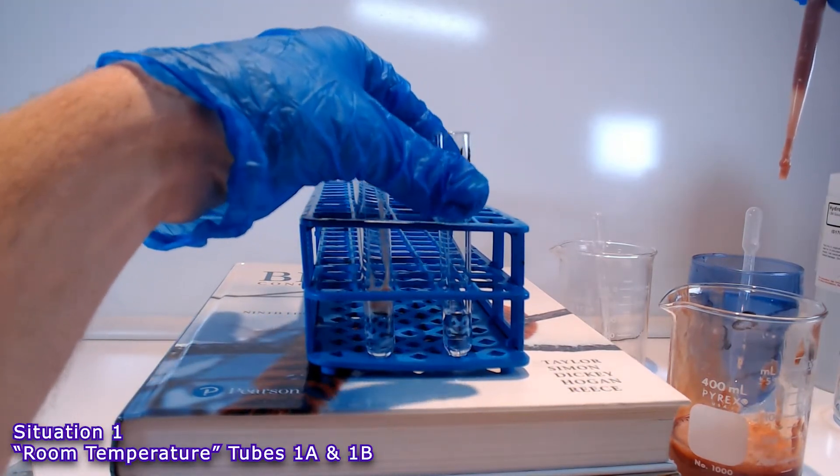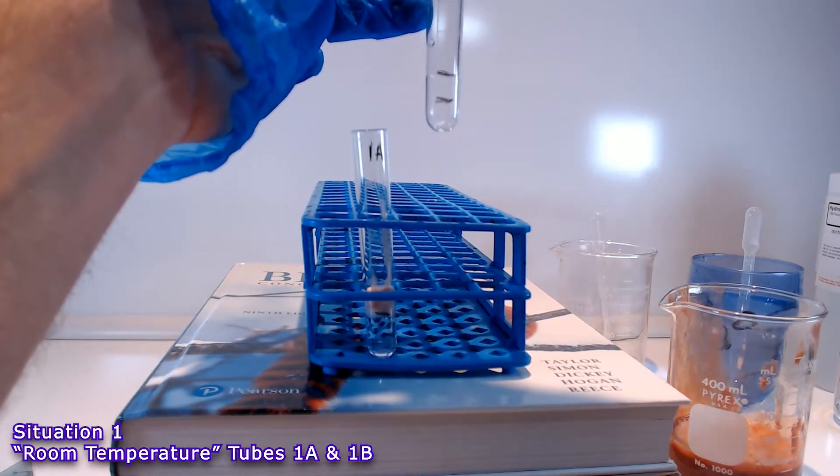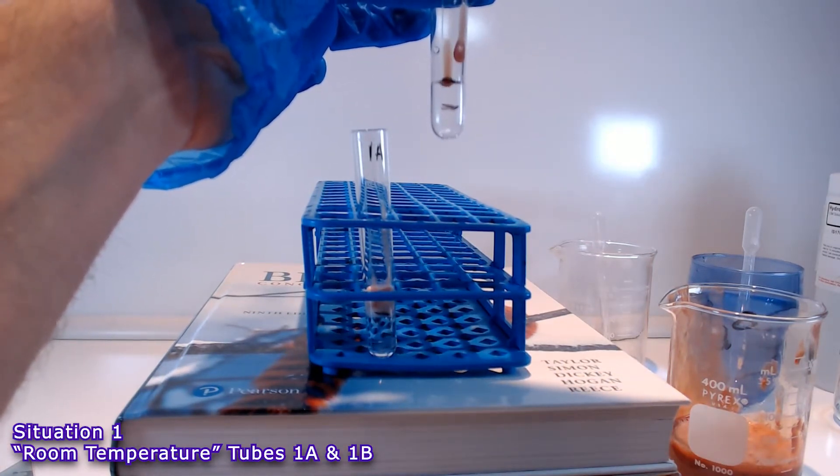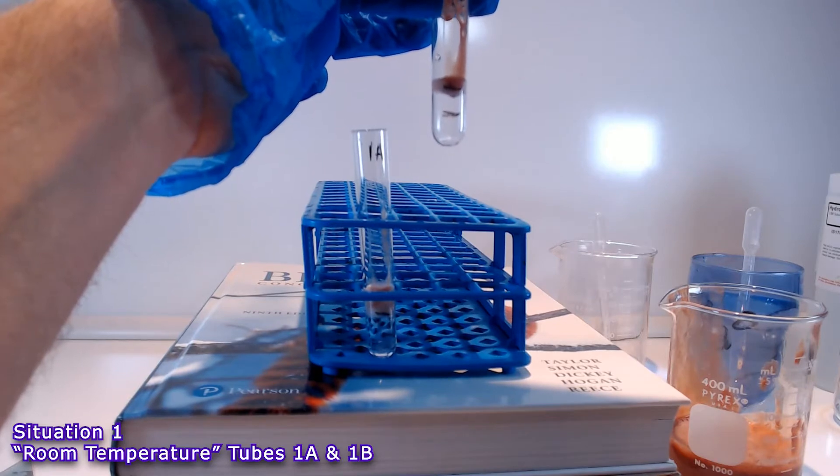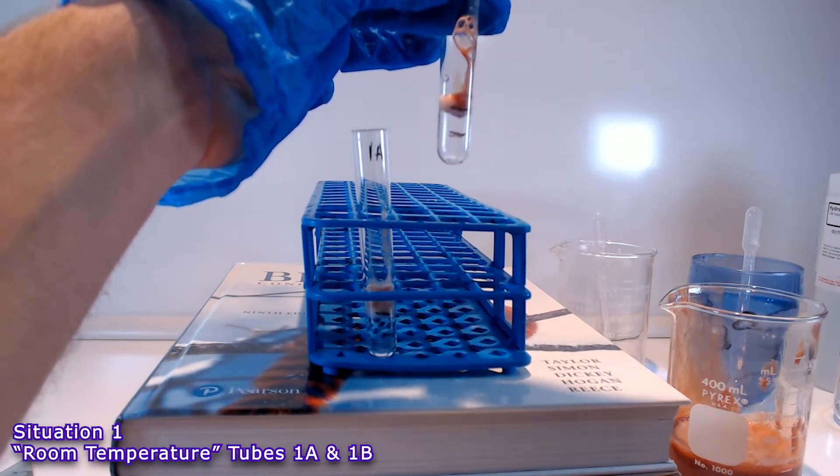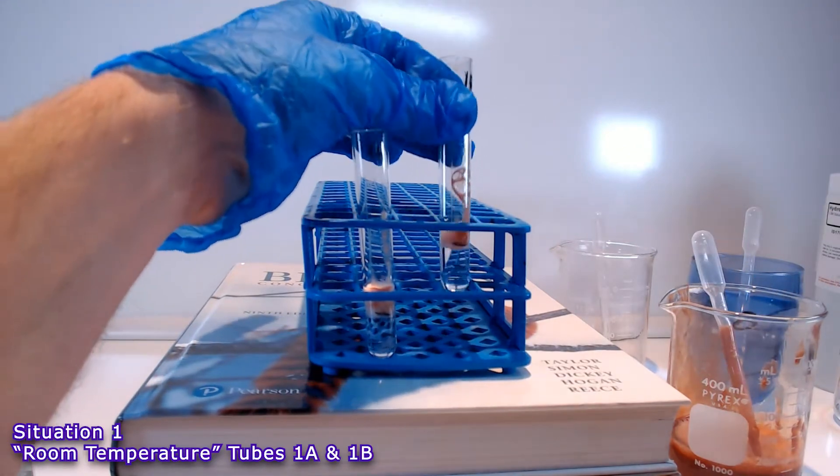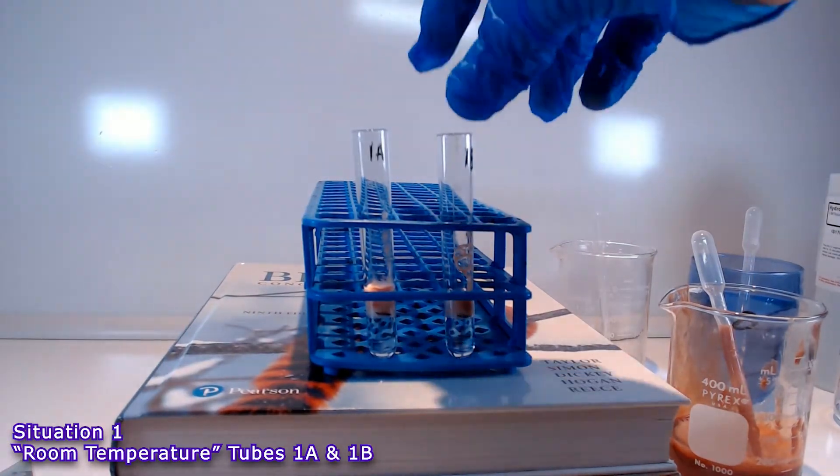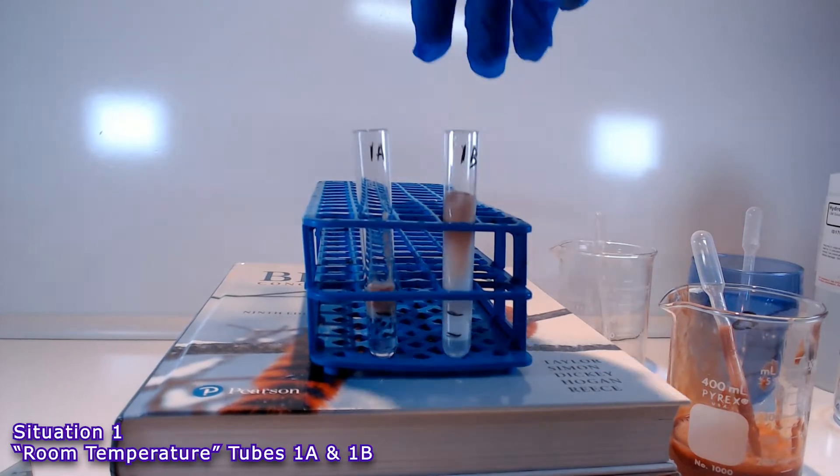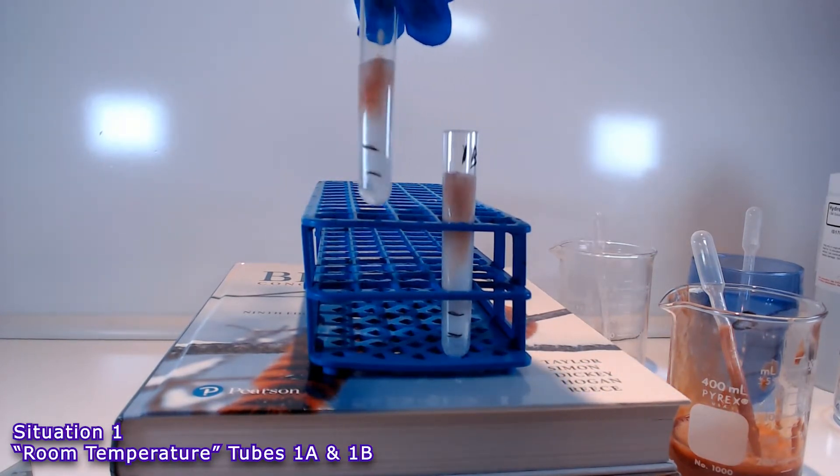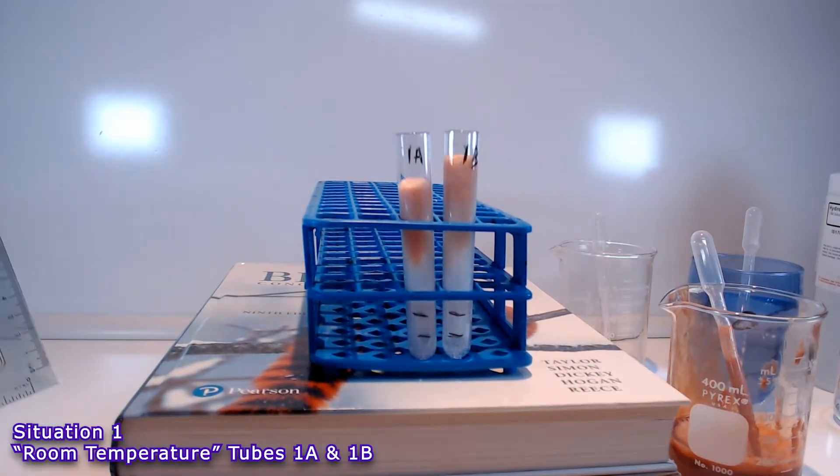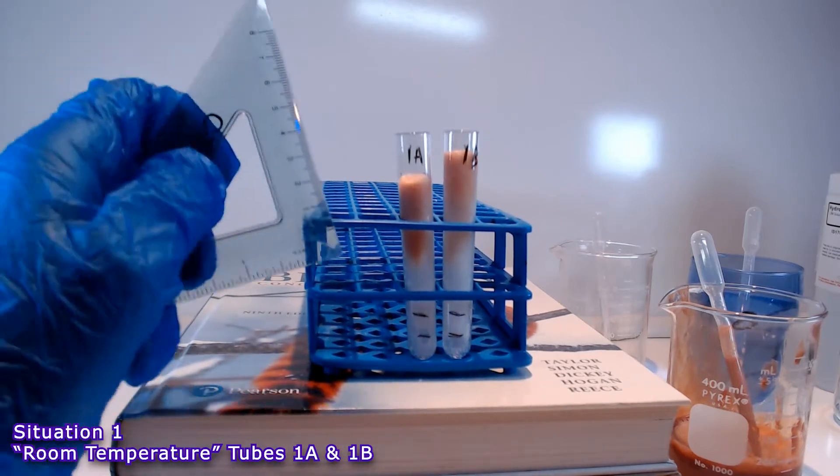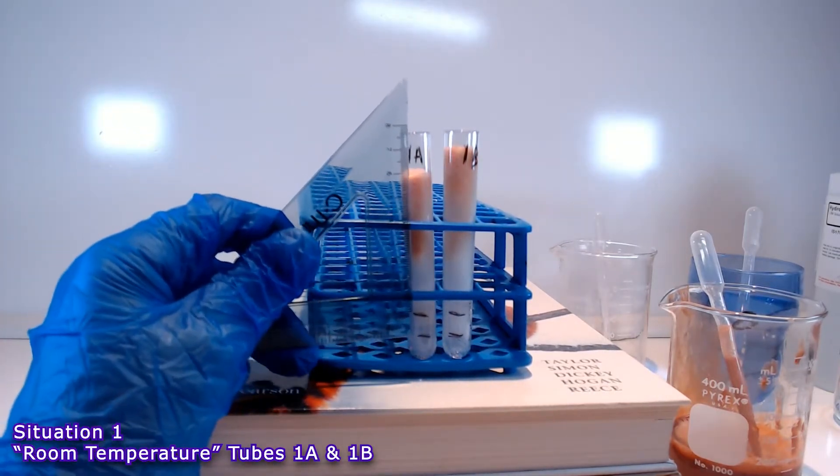You can already see some bubbles beginning to form. Refer back to the lab protocol to understand what those bubbles represent. Now in order to make sure that the substrate and enzyme are mixing, let's agitate the solution a little bit, and you can see that not only do we form a column of bubbles, but that the column forms very rapidly as well.